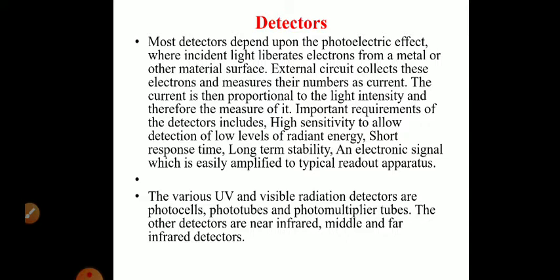Number two, short response time. Number three, long term stability. And number four, an electronic signal which is easily amplified to a typical readout. So these are the important requirements that a detector should possess.